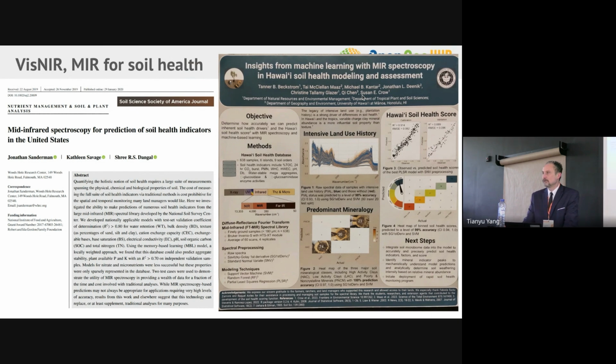You see, people like Kostas and me, we do this data science, and we can try all the possible models. And if we find a relationship, it's a bingo. So you could directly just scan a soil and say, this is the soil health. The colleagues from Hawaii said they got really good results, R-square 0.91, to estimate the soil health score. So independently, scan and soil health score assessment, they get a high correlation. But it was only in Hawaii, so someone studied it.